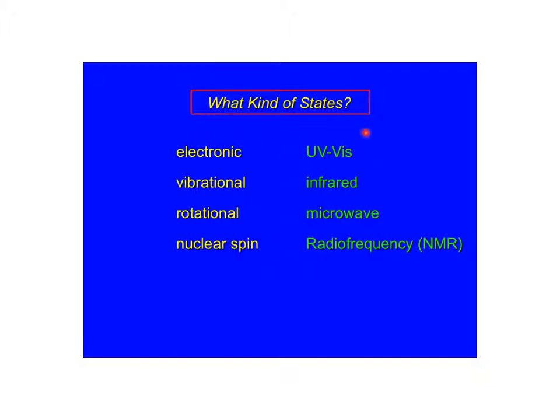And then the UV vis actually tells you the electronic portion. So that really is talking about the electrons bumping from one energy level to the next energy level. And so you just focus your spectrophotometer, or each of these spectrophotometers focus on a specific range of wavelengths, and it can tell you different pieces of information about those that are spectroscopically not silent. Because we'll get to it in just a moment.